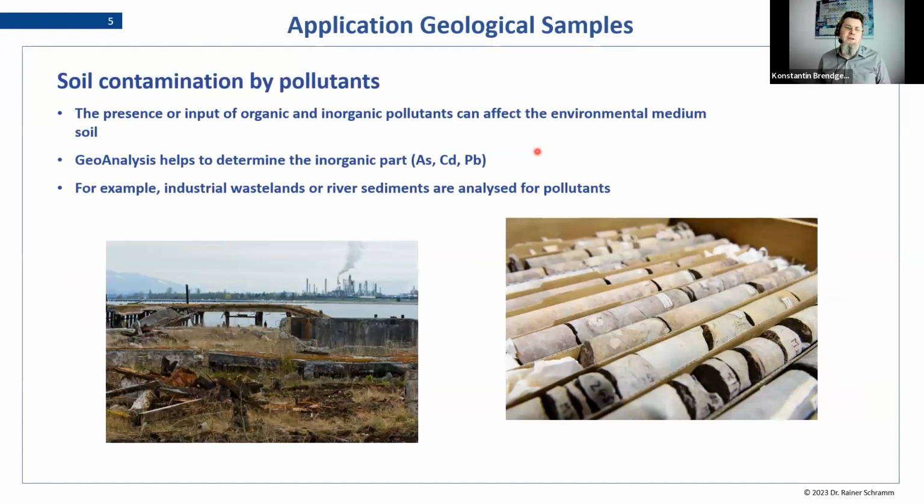Another field for a geological sample is soil contamination, and in general soil samples. The field here is different from looking for mineral wealth. We are looking for contaminations here that may have occurred in the past.